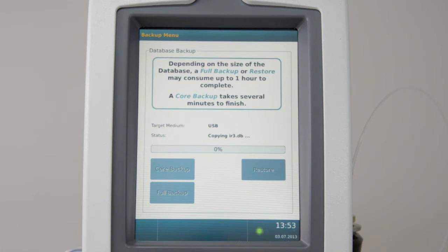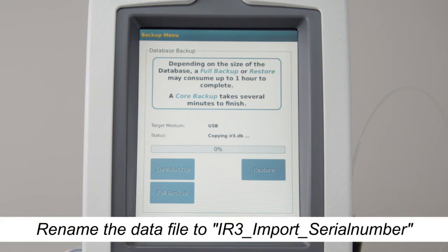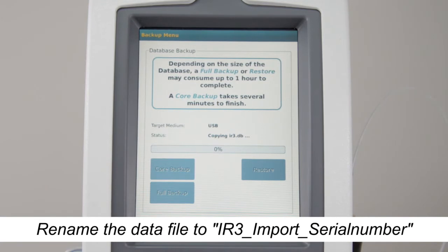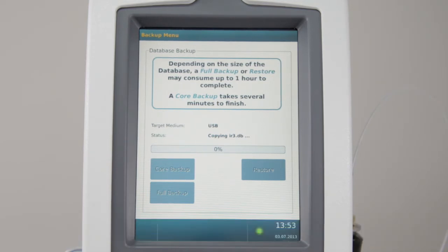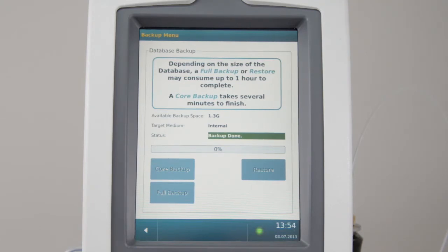To restore a full backup, rename the data file to IR3 import serial number, and save it to a USB device for upload on the IR expert.